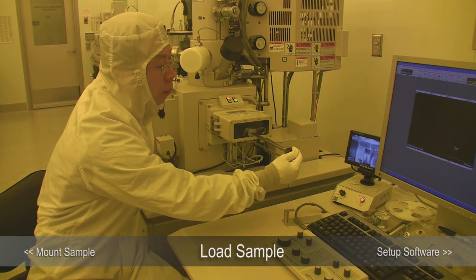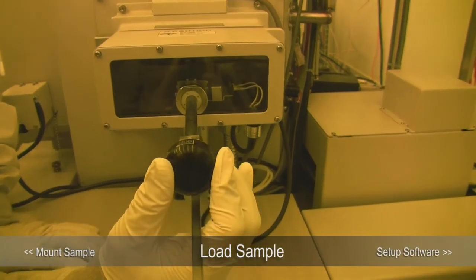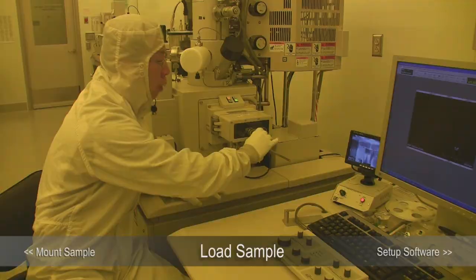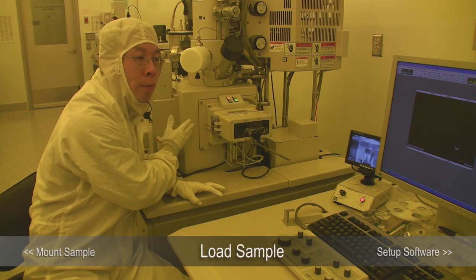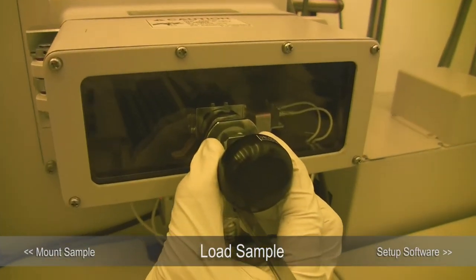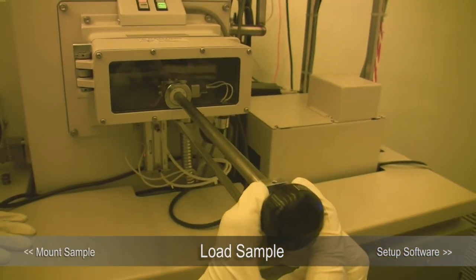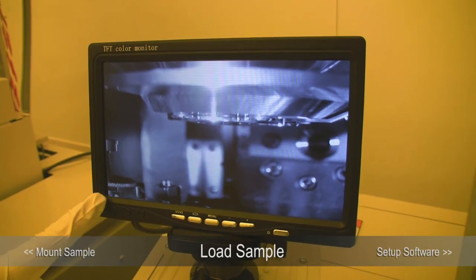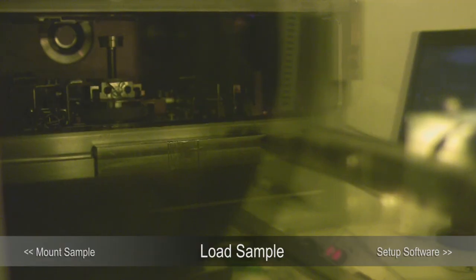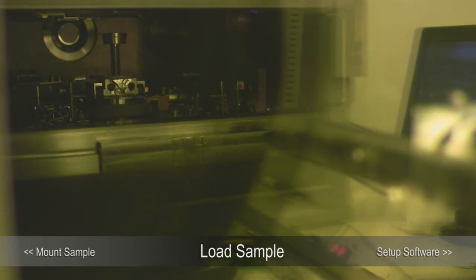Right now the sample holder is in the locked position. Once we push it in, we go to the unlocked position, and then the sample holder will be left inside the chamber and clamped down by the stage. After we unlock, we pull the exchange lock out. When the sample holder is fully engaged on the stage, you should see half of the sample holder on the monitor. If you forget to check the height, look through the window rather than the monitor, because the monitor only shows you the endpoint at the stage — looking through the window you can see everything.